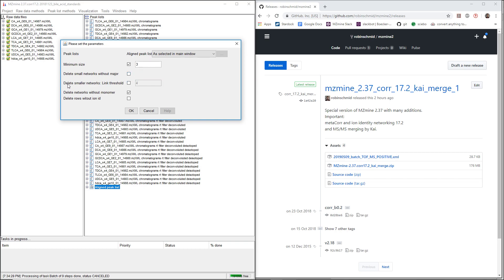Then we have delete smaller networks. This is also very important for the last step because we need to delete the smaller networks.